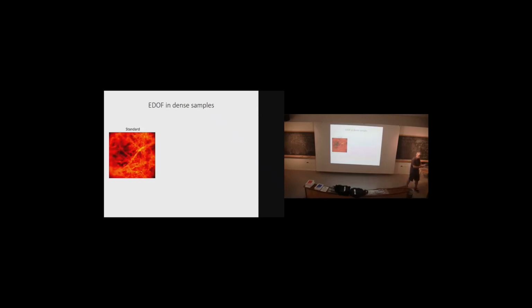If you take a standard image with a one-photon microscope, you've got in-focus light, and this is the problem with one-photon microscopy. You don't reject the background. So part of your image is in focus, a lot of your image is out of focus. Now, what I'm going to do is very quickly, in a single camera exposure time, scan the focus. And what do I get? I get these images. Now, it looks like I've actually done worse, right? This image looks worse than this.